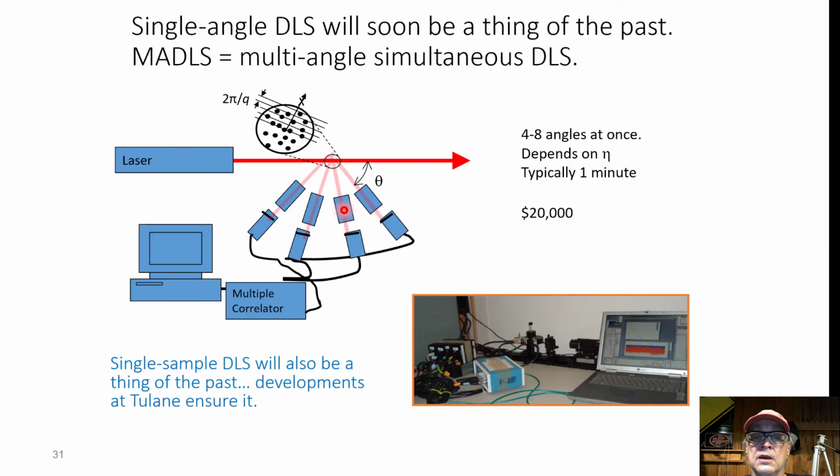Well, one thing you may be wondering, we started to wonder a few years ago whether it's possible to do all these things quickly using multiple angles. The machine I showed you so far just measures one angle, then you change to another angle and make another measurement, and so forth. It's very slow and tedious, but boy, does that machine have great optics.